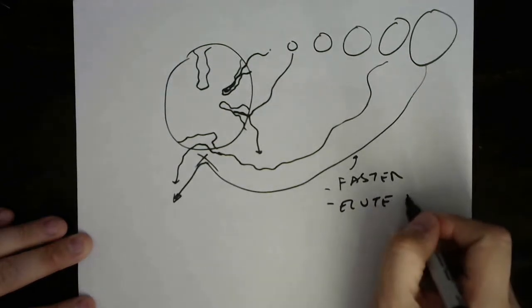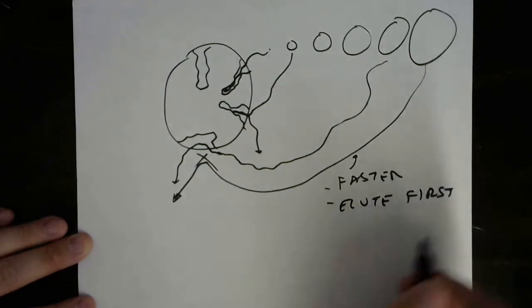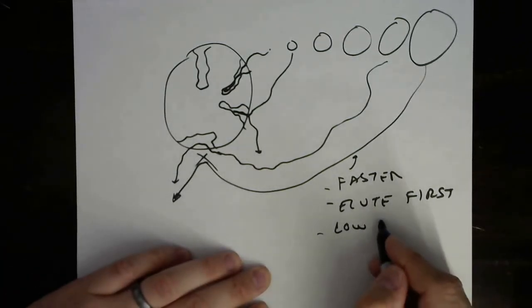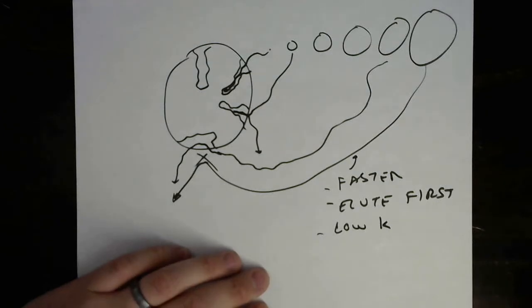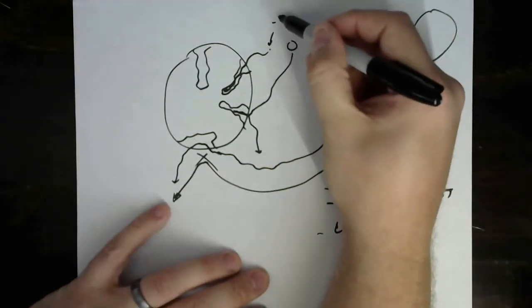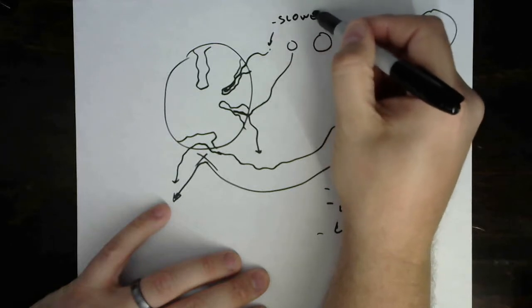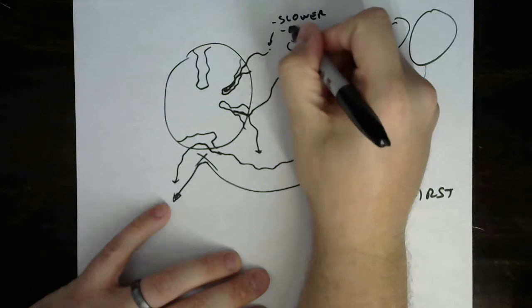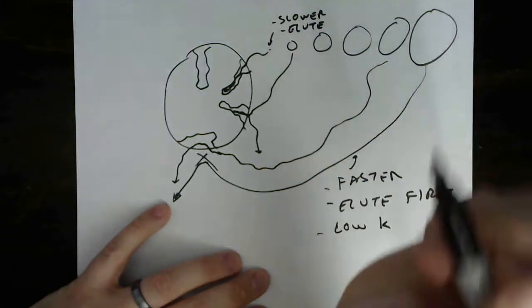That's the same thing as saying they have a low retention factor, which is lowercase k, right? Whereas these things, on average, move slower because they spend more time stationary inside the particle. They elute later, exactly as we just described in the chromatogram.